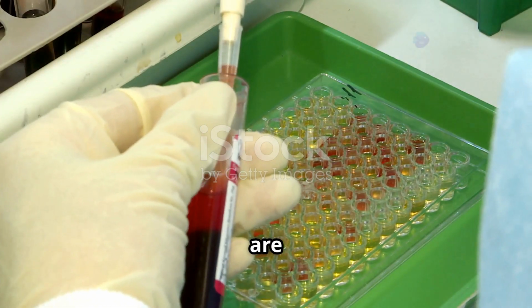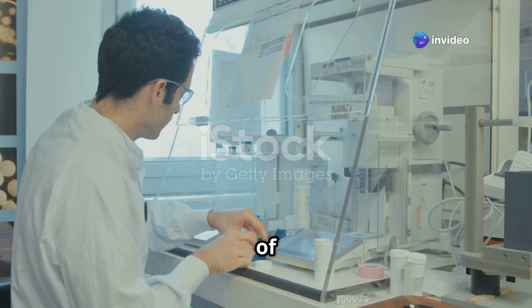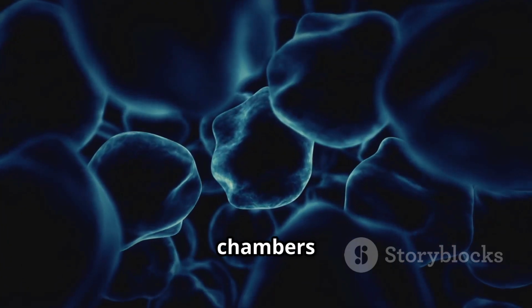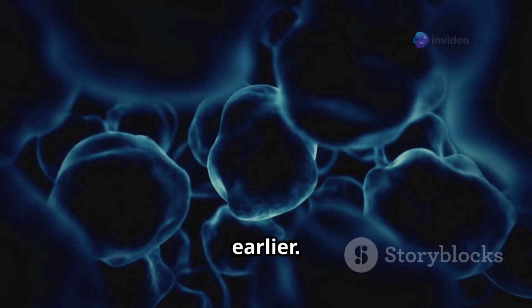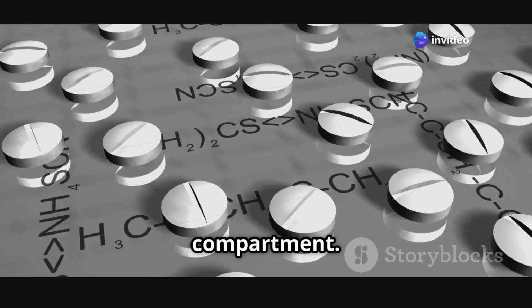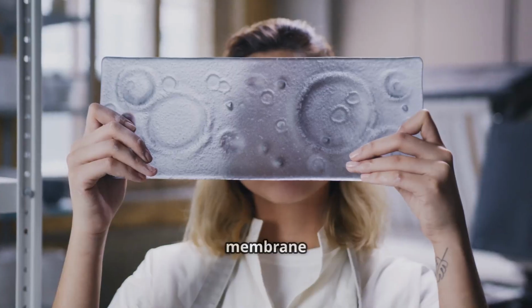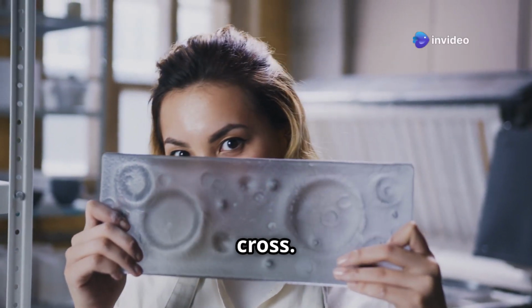Franz diffusion cells are essential tools for conducting IVRT. These specialized pieces of equipment provide a controlled environment for studying drug release from a dosage form. Imagine them as tiny chambers with two compartments separated by the membrane we discussed earlier. The dosage form, such as a tablet or cream, is placed in the donor compartment. The receptor media, simulating bodily fluids, is placed in the other compartment. The membrane separating the two compartments acts as the barrier the drug must cross.